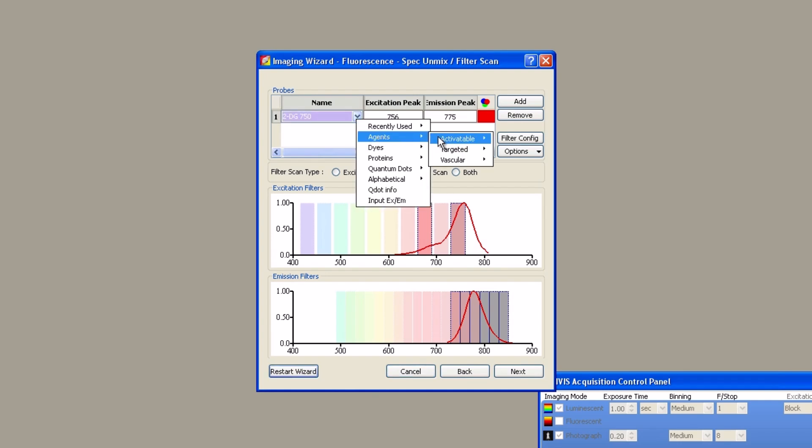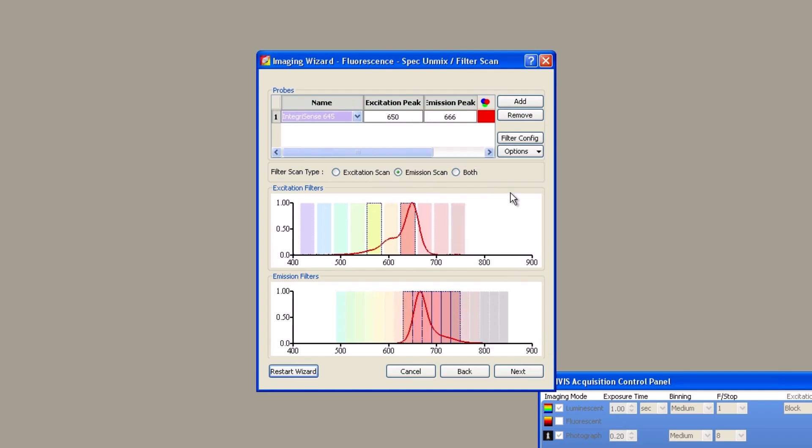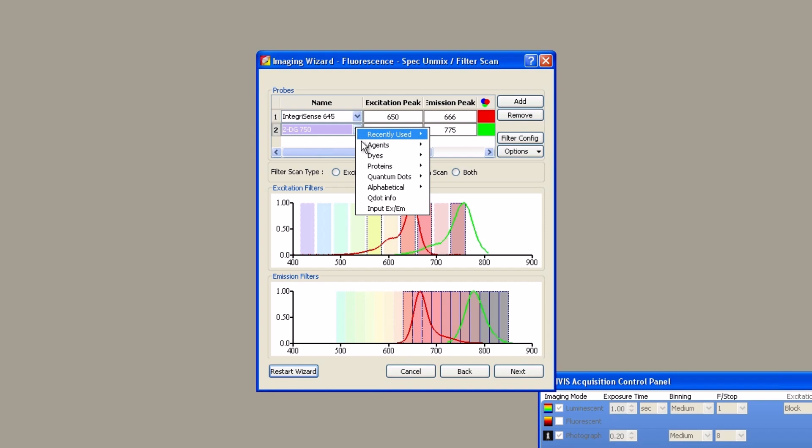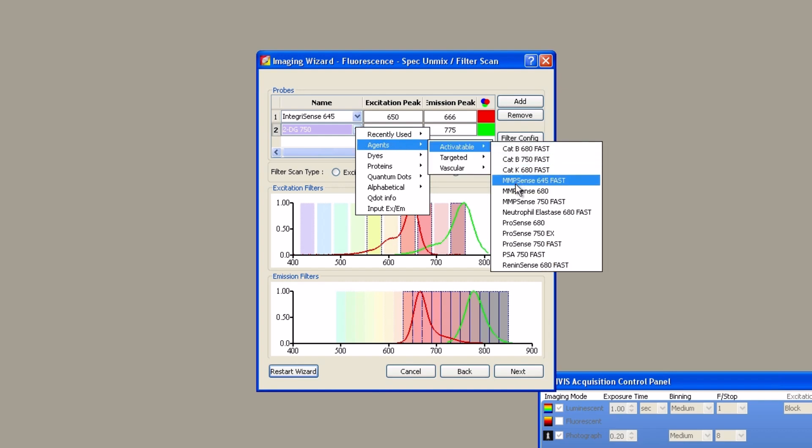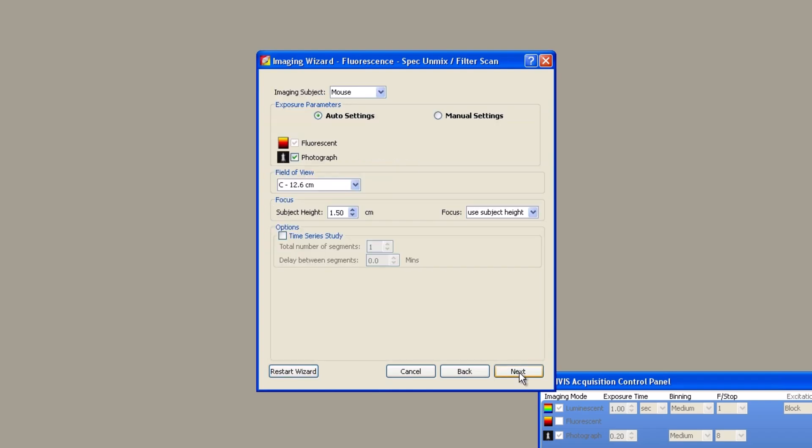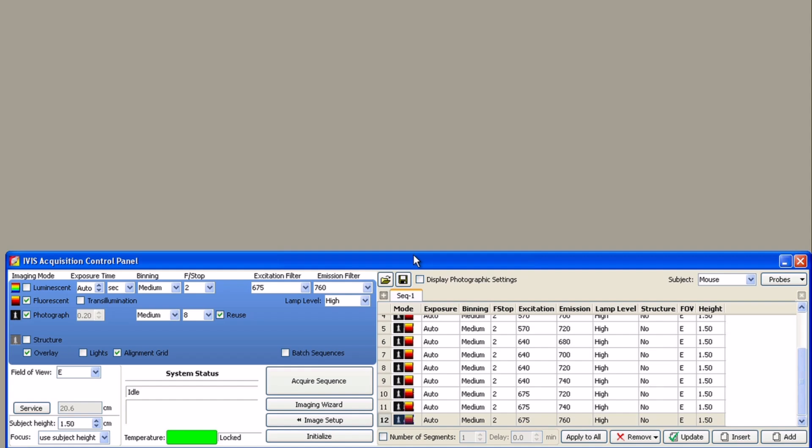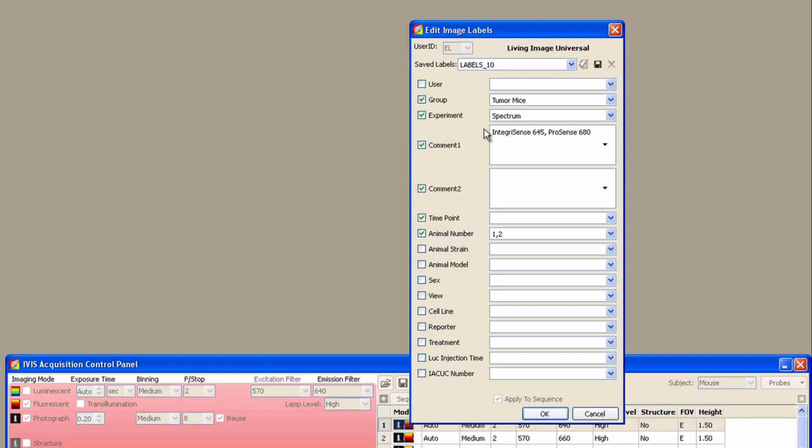As a default the wizard will set up acquisitions for one probe. To add a second probe click the add button. If your probes are pre-programmed in the software you can choose them from the drop-down menu. If not, you can manually enter the excitation and emission maxima and the software will choose the appropriate filters. Click next, complete the last window of the wizard to include your imaging subject, auto or manual acquisition settings, and your desired field of view. Then click next.